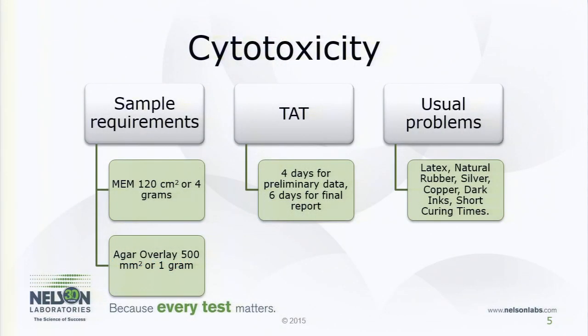So the first thing we're going to cover today is what I like to affectionately call your best friend and your worst nightmare, and that's the cytotoxicity test. The reason I call cytotoxicity your best friend and your worst nightmare is because historically, this is the most sensitive test we have for biocompatibility.